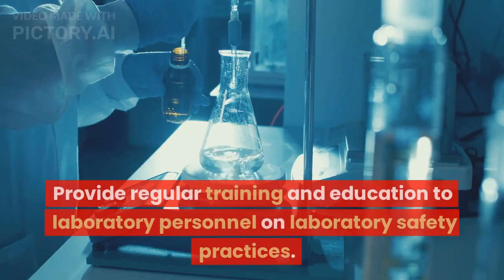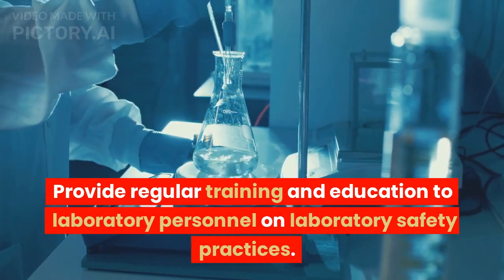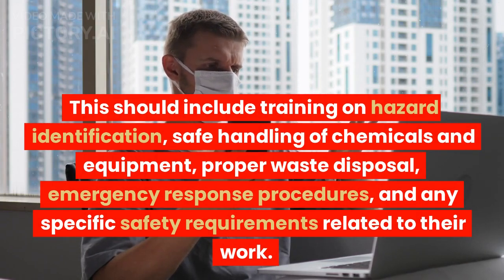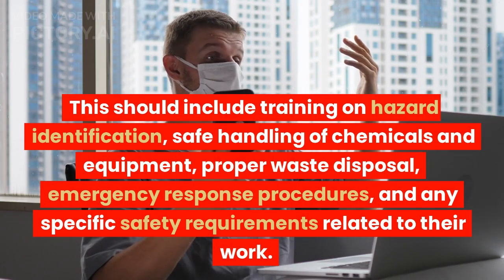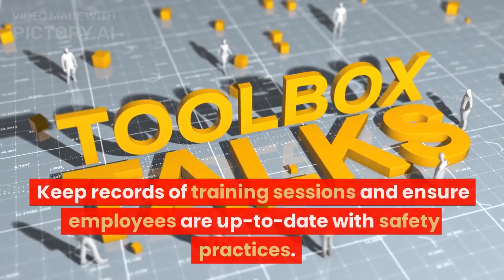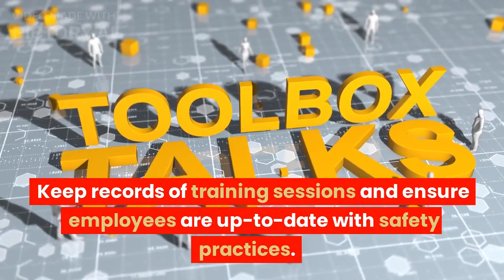5. Training and education. Provide regular training and education to laboratory personnel on laboratory safety practices. This should include training on hazard identification, safe handling of chemicals and equipment, proper waste disposal, emergency response procedures, and any specific safety requirements related to their work. Keep records of training sessions and ensure employees are up to date with safety practices.